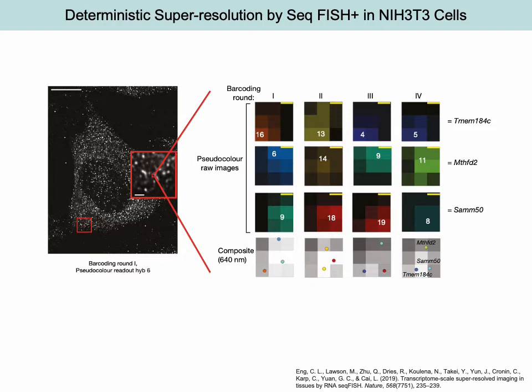Another way to do it is using expansion microscopy, which was how this was done in the first methods. But when you expand the samples, you have to image longer, and this also brings a problem: the sample will continue to morph. So you can repeat rounds of hybridization, but this is going to make it really hard to line up the dots over the multiple rounds.